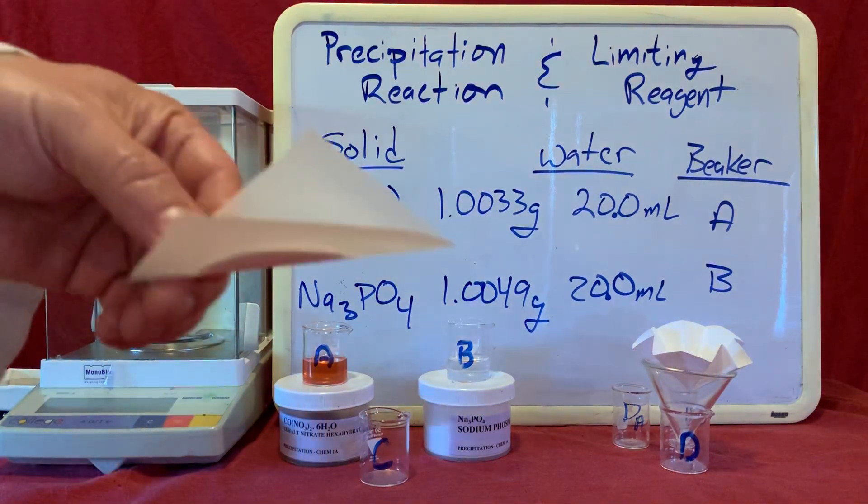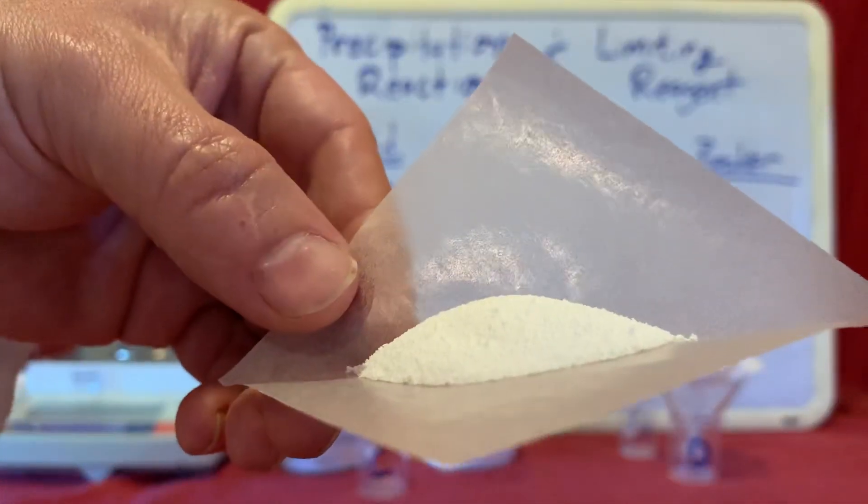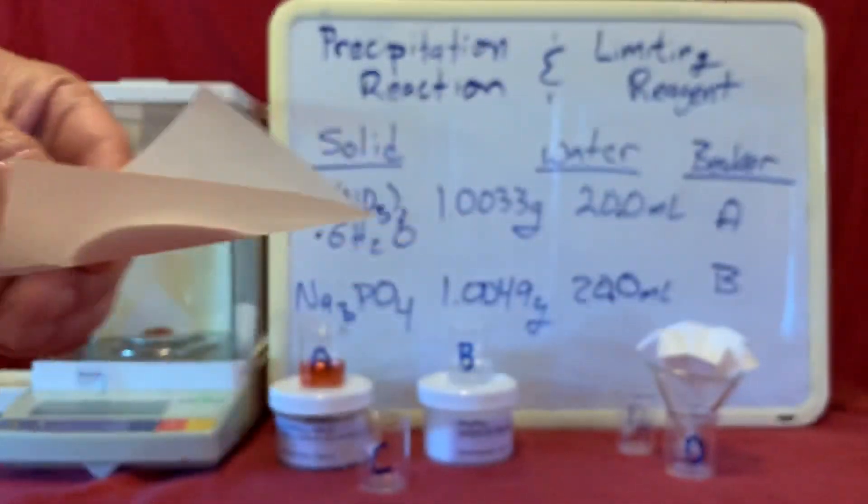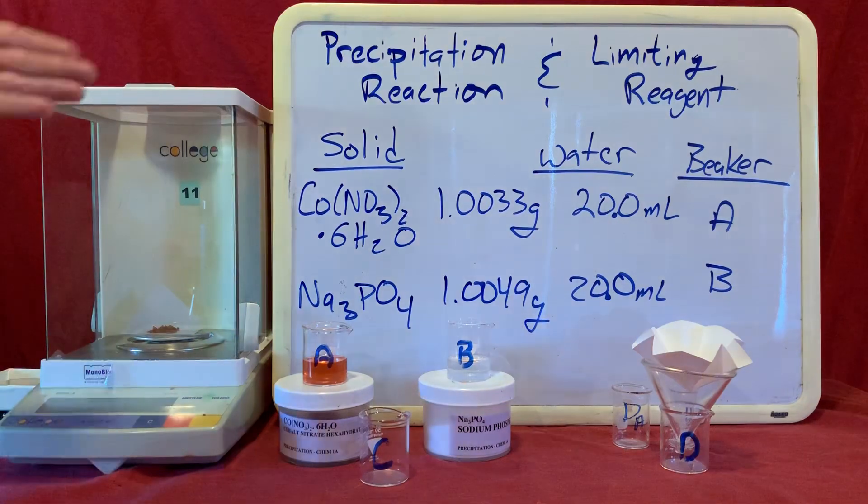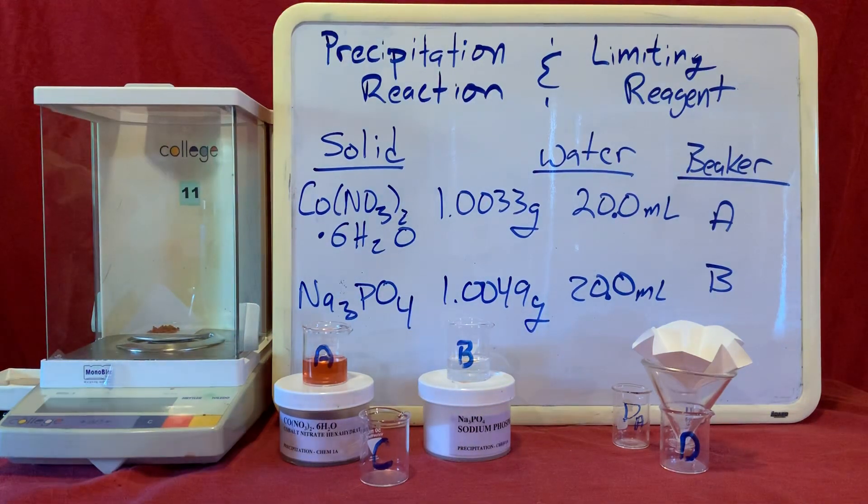I measure out approximately a gram of our sodium phosphate and dissolve it in 20 milliliters of water. You can see the exact amounts that I used up here on the board for all of our materials that I've just referenced.